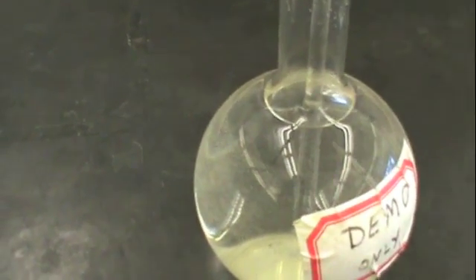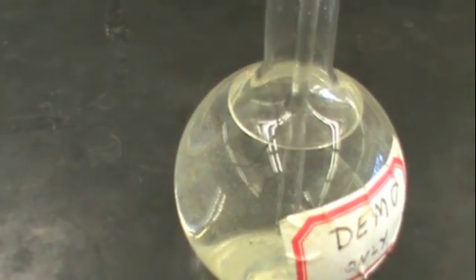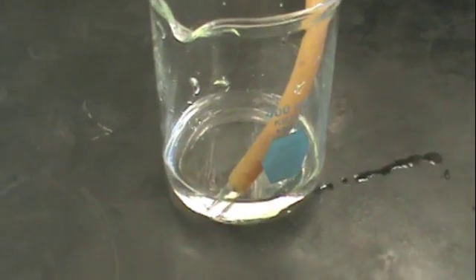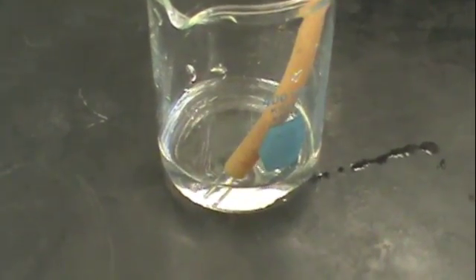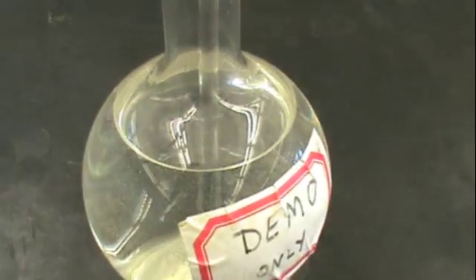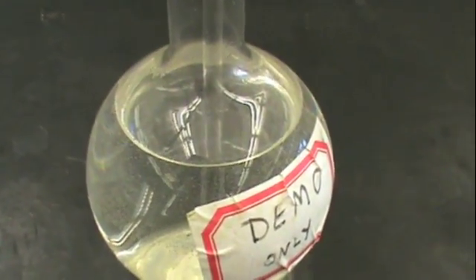You will notice that water begins flowing out of the Florence flask and into your beaker immediately. You do not need to continuously shake your flask with the peroxide and yeast for the reaction to keep going.